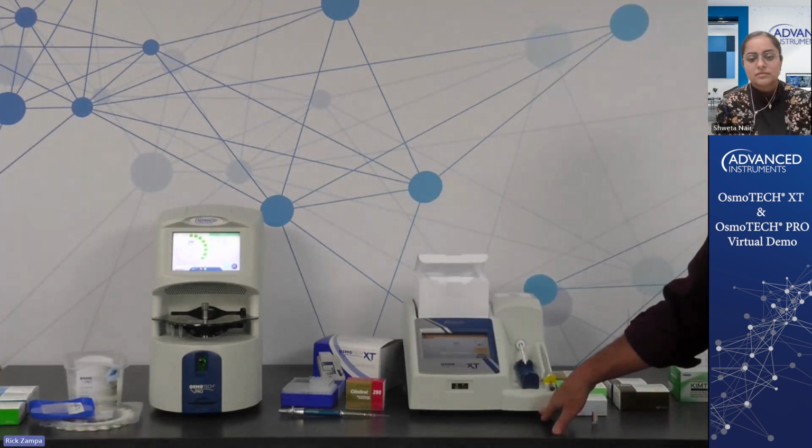That's actually something we didn't talk about when we were talking about compliance. Many of the compliance organizations and the pharmacopoeias recommend that you run everything in triplicate. So you have to keep that in consideration when looking at the osmometer you're selecting. You may have only a few samples to run, and you might feel that the single sample is best, but with those few samples, if you're running everything in triplicate and running your controls, maybe a multi-sample is the better option, so that you can just load everything on at one time and let it run, and then come back and get your results when that's finished.